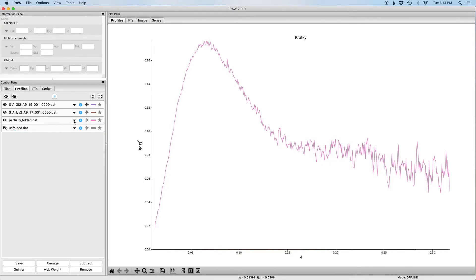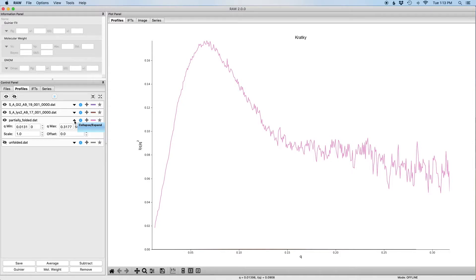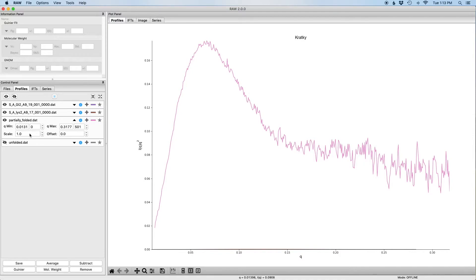Then I'm going to click on this triangle here for any of these profiles. This triangle lets us see more information and more controls for the profile. So once I click it you can see that I can see the qmin and qmax values and I could adjust those for the profile. I can also apply an offset and a scale factor.